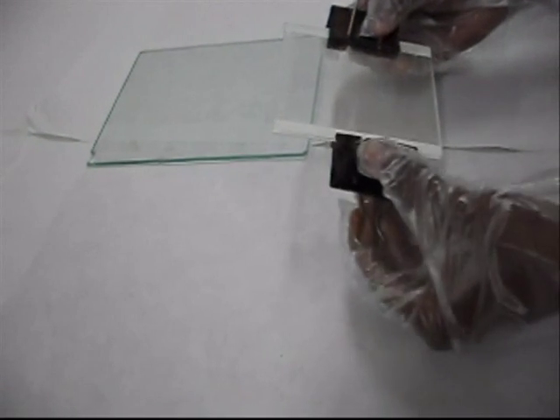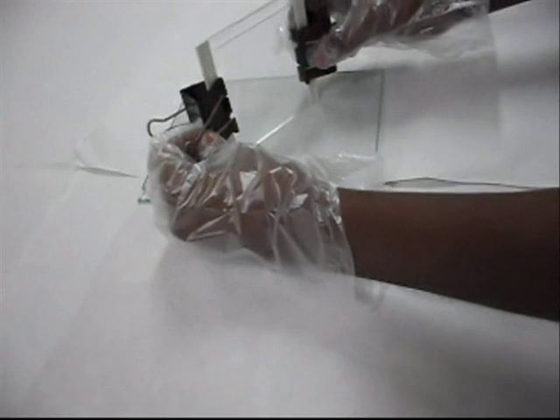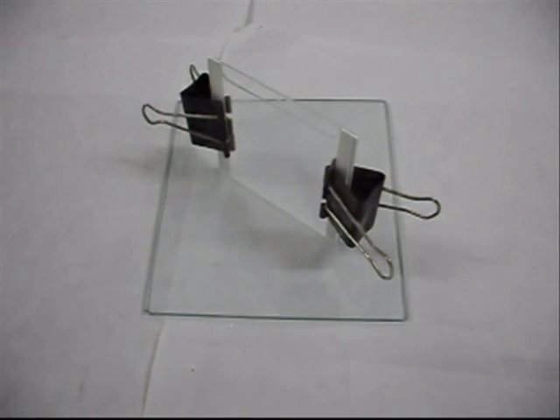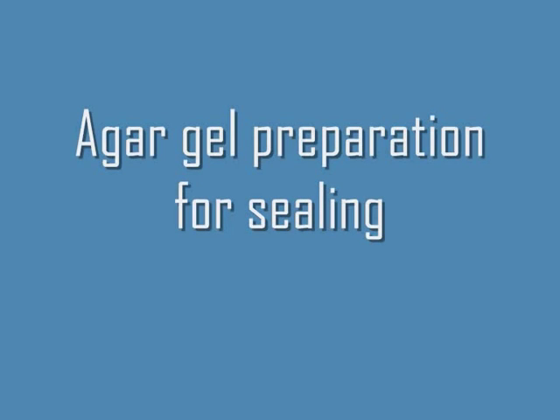Hold the assembly together with bulldog clips and then place it in a base plate. The agar is to be mixed well with water. It should be in the form of gel for better sealing.